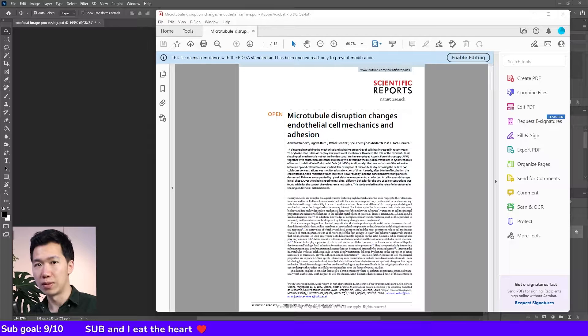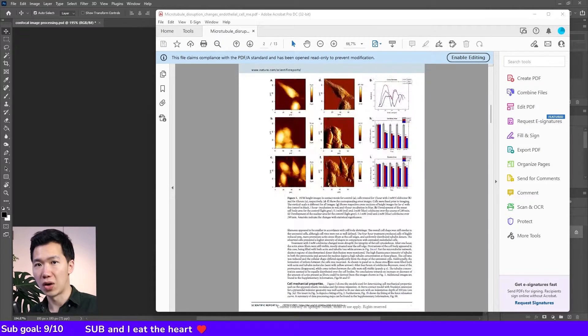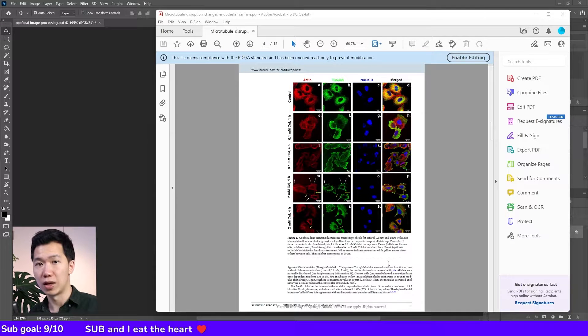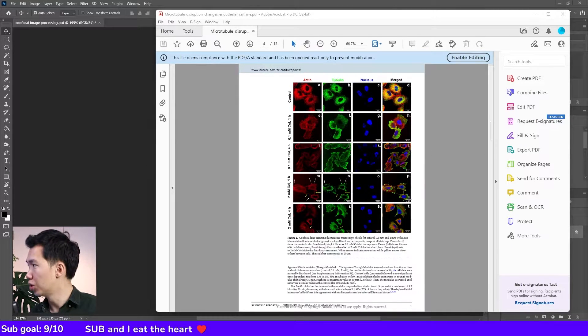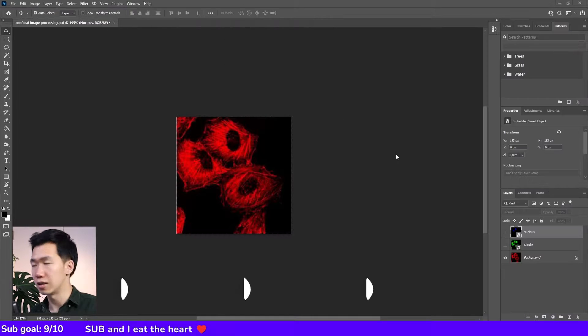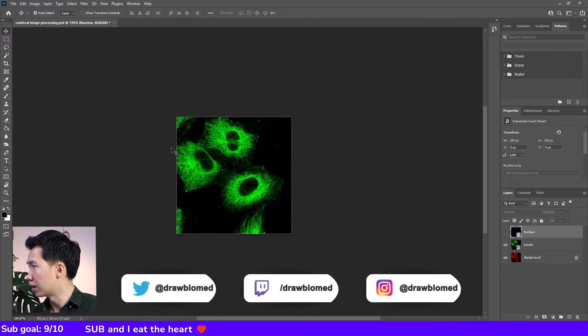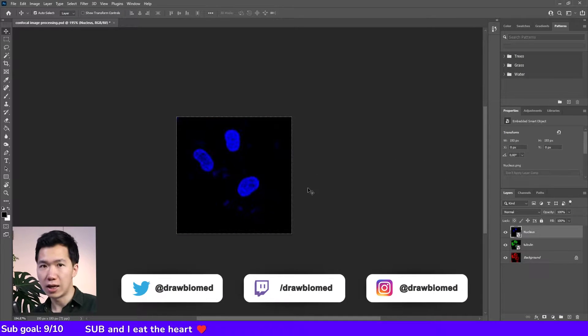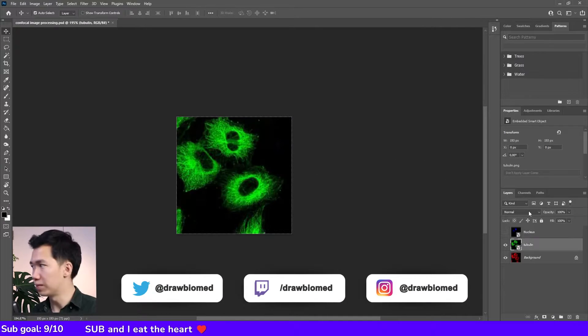This is an image I got from an open-access article and it has red, green, and blue channels. Usually these are actin, tubulin, and nucleus. And I'll show you how to overlay them.